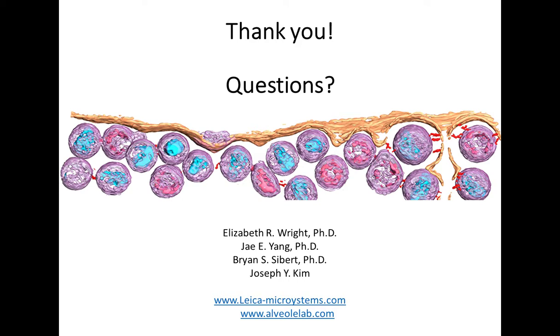Yeah, that's a good question. And unfortunately, it's one that really depends on the cell type that you're seeding on the grid. We generally use something like 10 to the 4th cells per mil on the grid, but that, again, changes based on the cell type. So that's something that you really need to determine for your specific cells on the grid.